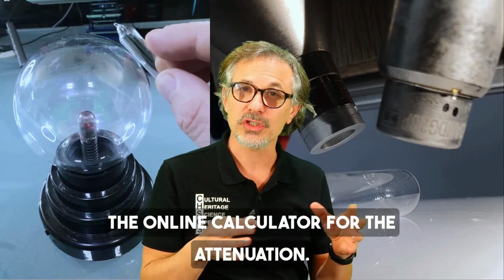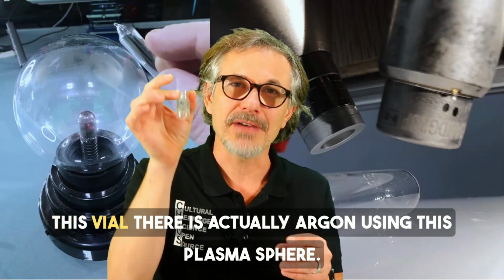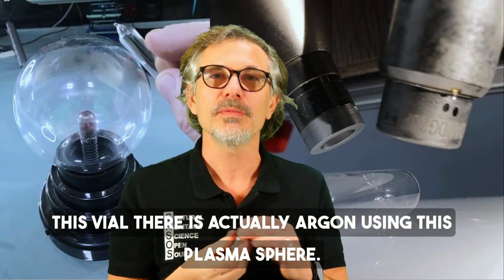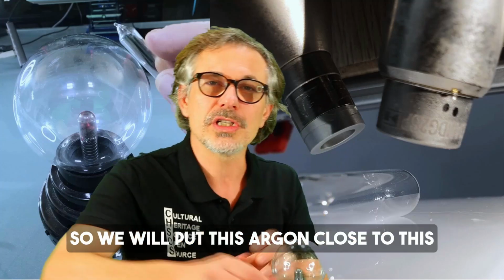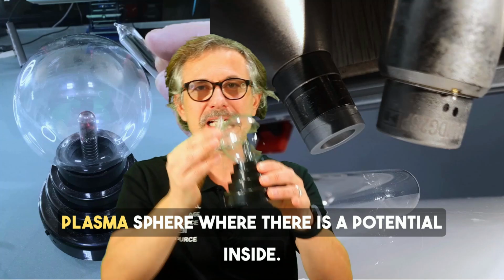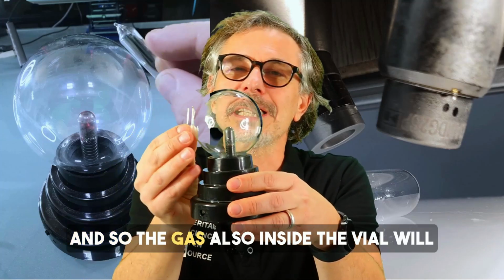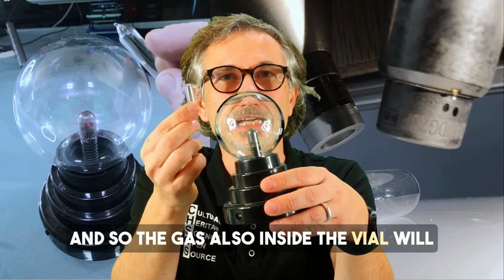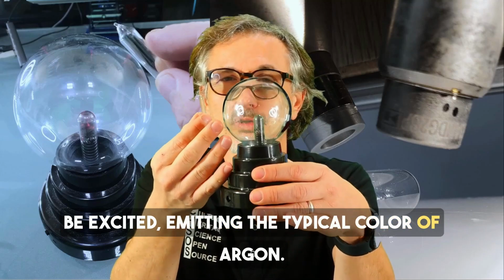They are stopped by very thin glass, as we could see from the online calculator for the attenuation. We can do an experiment just to check that inside this vial there is actually argon, using this plasma sphere. We put this argon close to the plasma sphere, where there is a potential inside, and so the gas inside the vial will also be excited, emitting the typical color of argon.